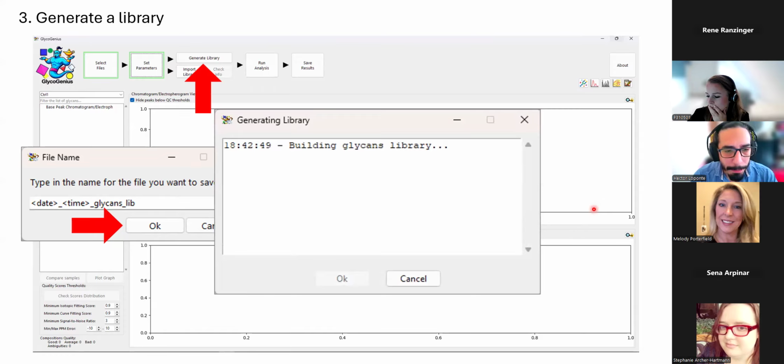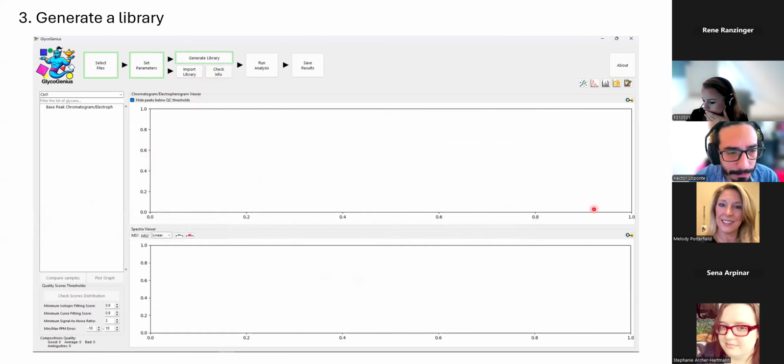And then a new window will pop up where it will start the library generation. For this library, it will probably take just a few seconds. For very large libraries, or if you are using a high resolution isotopic distribution, it might take a while. Even for up to 10,000, it usually takes up to a few minutes with fast isotopic distribution. Once the library generation is finished, you can click on OK, and the button should turn green as well, indicating that you have done this step.